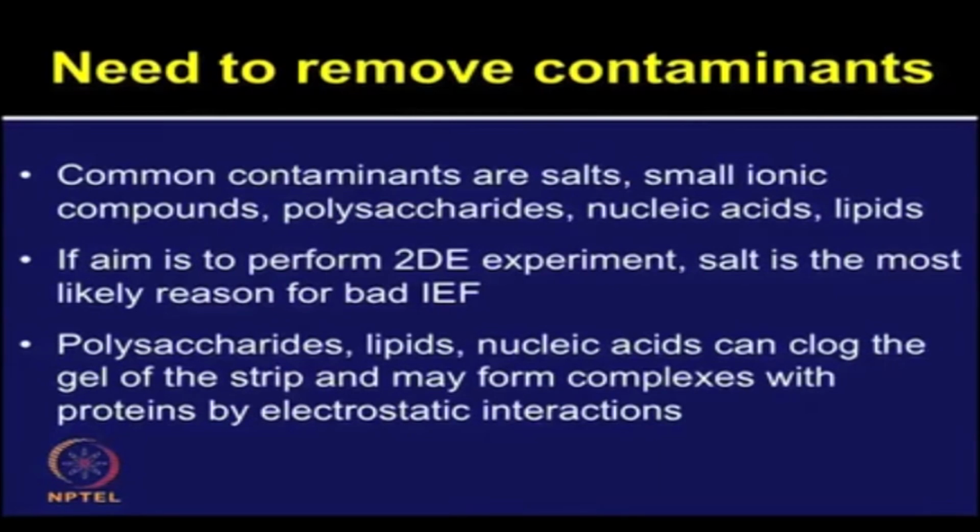Now, there are different types of contaminants which may also affect the quality of your proteomic experiment, such as polysaccharides, lipids, nucleic acids.